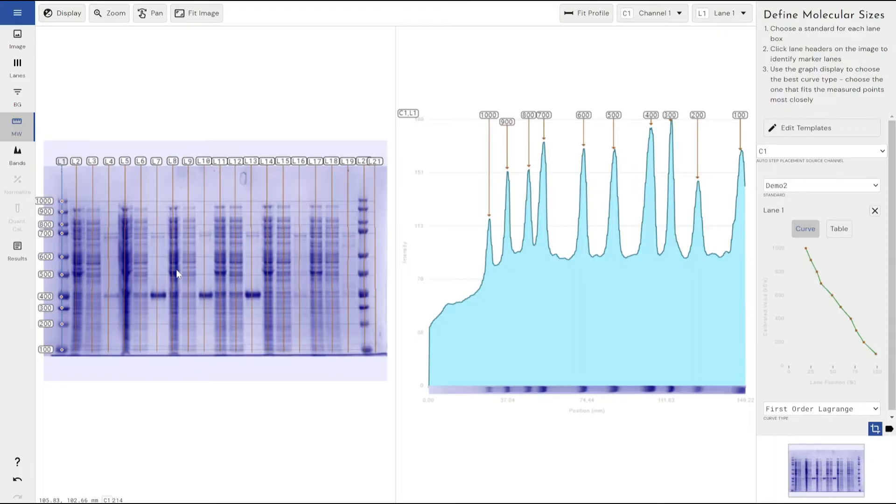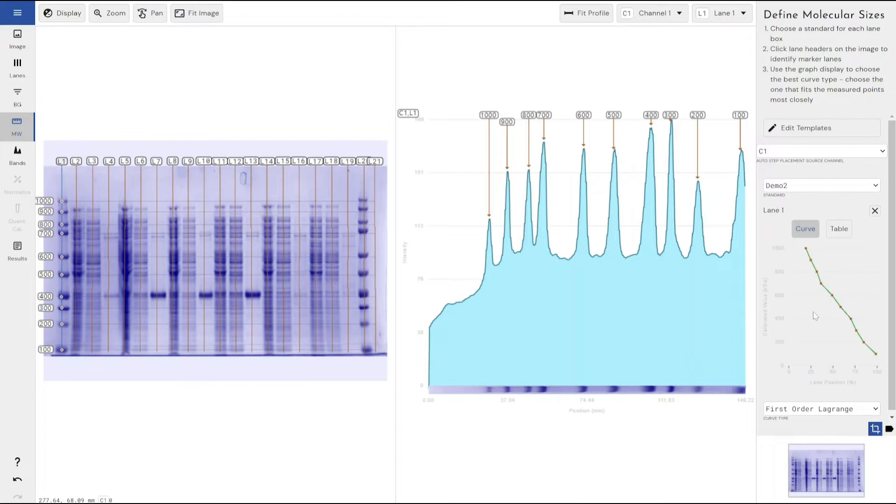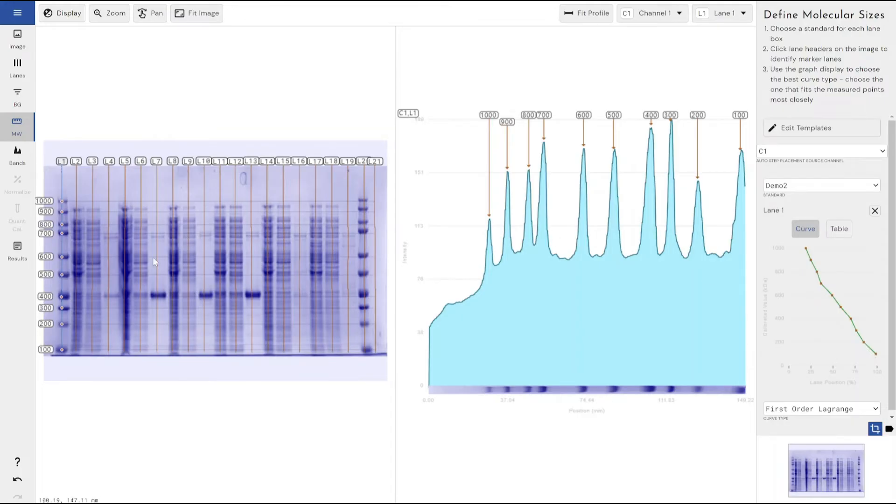Once we've performed that, once we've added the steps to the ladder, we can then come and check how smooth our line of best fit, how smooth our curve of best fit that our unknown samples, all of these bands, are going to be compared to and extrapolated from.